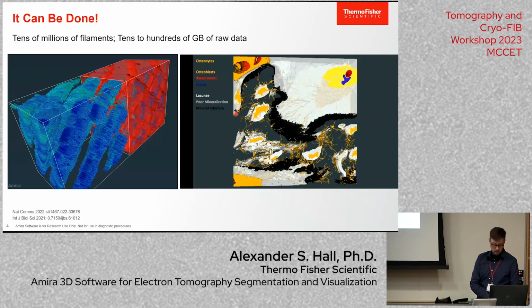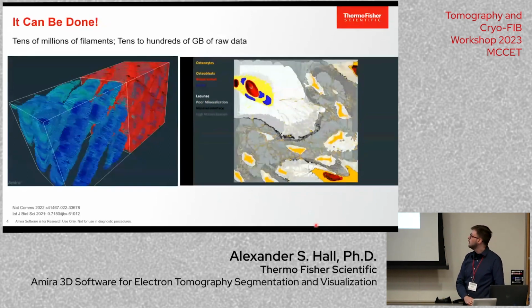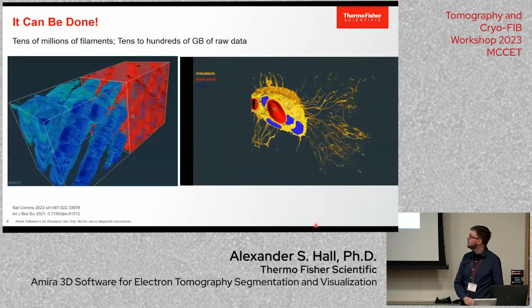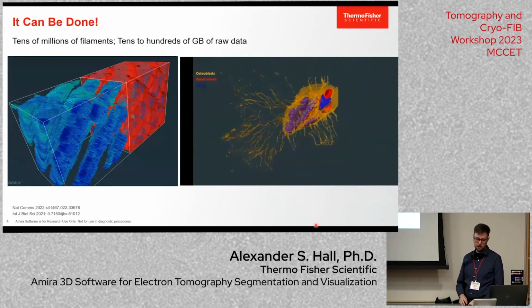And then on the right, I'll show a little animation here. Let's play, please. You can see how we've isolated different regions according to what an expert observer found them to be. So we've got blood vessels, osteoblasts, and again, this was a study of the osteocytes and the lacunae that they live in.